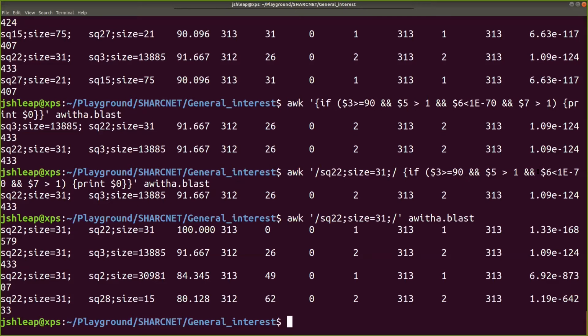Again, I know that this is a lot to take in, but what I want you to get from this webinar, and then you can come back to it later, is where to look for things, right? So you know now that awk will allow you to do a lot of types of filtering, and that's basically the main objective of this.